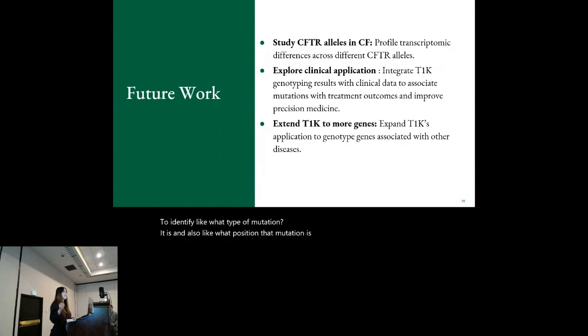So if you have other genes that have a similar variant name structure, we can definitely test on those with this pipeline. And for other types of variant names, we may need a little bit of time to look into it. So I think it's pretty promising that it can be generalized to other polymorphic genes.